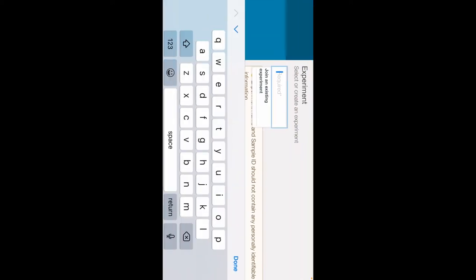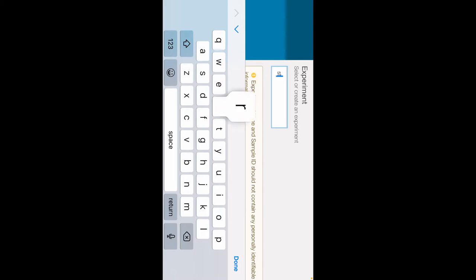I'm just going to go ahead and say straw aphid. It has to be different than the other input. Then I'm going to rotate that. Looks like we got all the necessary parts in there.